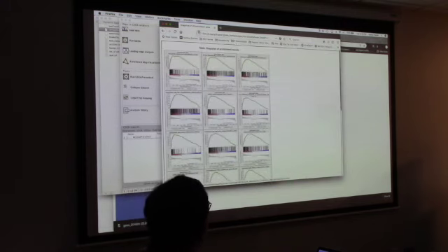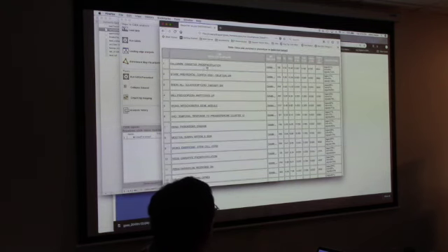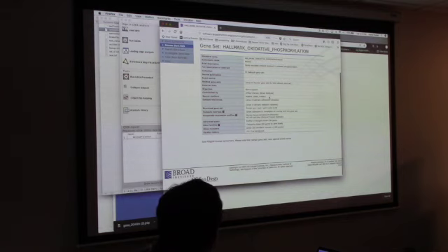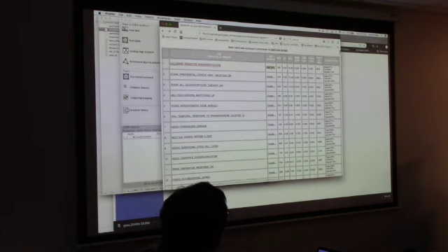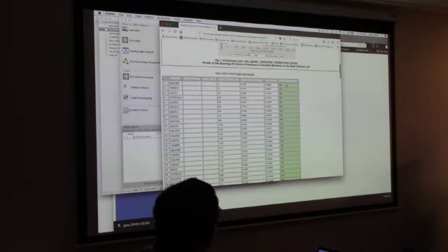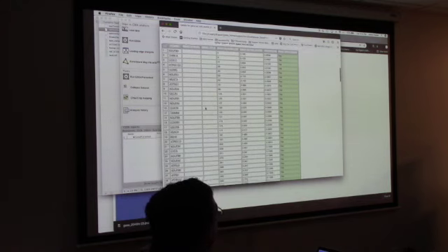Looks pretty good to me. And then you can go and look at the detailed enrichment results. So, you have your oxidative phosphorylation. You can click on that to find out what that is, what it means. And then you can also look at the related gene sets, and then you can go down the rabbit hole and click on these details for that gene set. It's an endless thing from here on out, right? You can look at the score, you can look at your genes that gave you this, like what is the rank in that gene list, and all of those things.